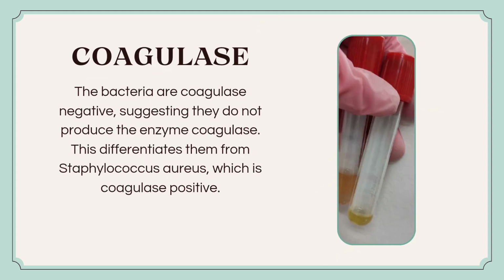Next is the coagulase. The bacteria are coagulase negative, suggesting they do not produce the enzyme coagulase. This differentiates them from Staphylococcus aureus, which is coagulase positive.